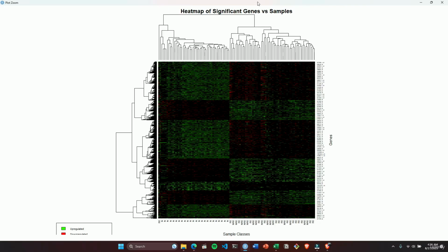Now my laptop is getting really hot. You can see these are the genes, these are the clusterization of your genes versus your samples. These are the top expressed genes and these are the samples that are given. And here is the expression.